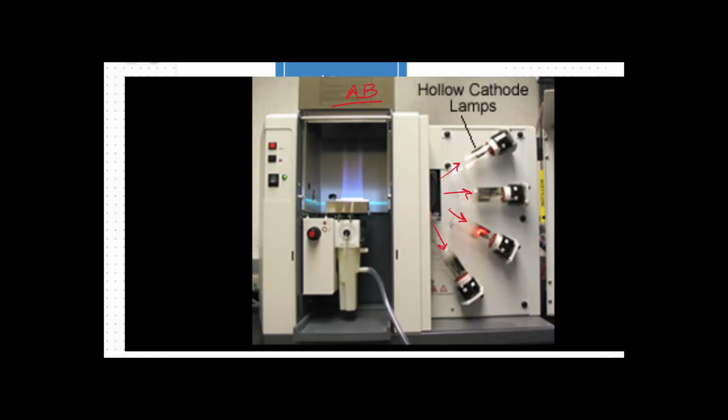So you can be specific with what it is you're looking for with absorption, but it can also be relatively cumbersome. Now, a flame AA is going to have less sensitivity than some of your other instruments or atomization techniques. And part of the reason for that is the background interference created by the flame itself. So remember, flames give off energy, and we can see that energy as light. And because what we're measuring is light, you have to take background readings and you have to subtract them from your analyte readings. If your analyte isn't well concentrated, it's going to be difficult even for some of our more high-powered instruments to subtract that background out as signal to noise.